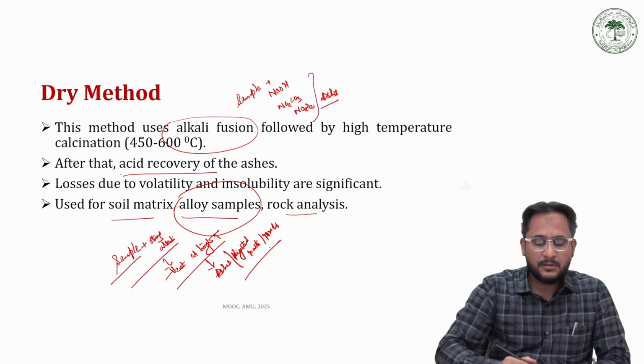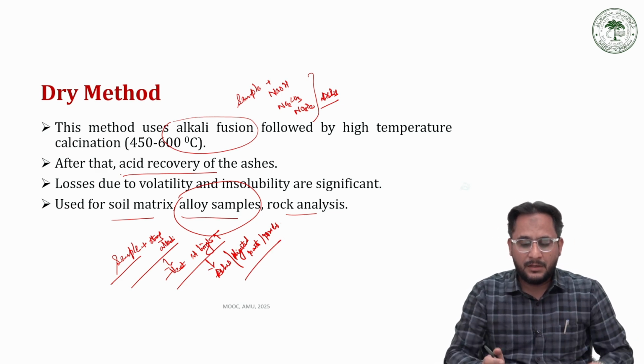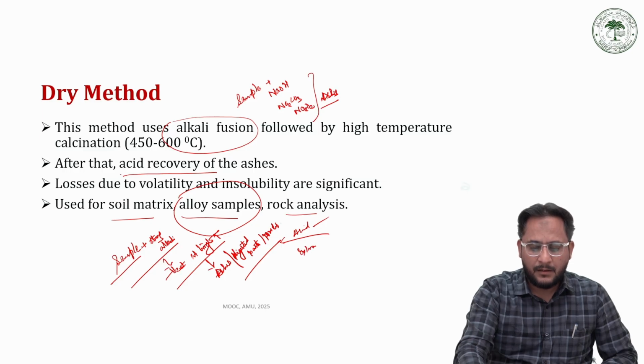Then to this paste or powder, we add acid, and that acid extracts the elements.